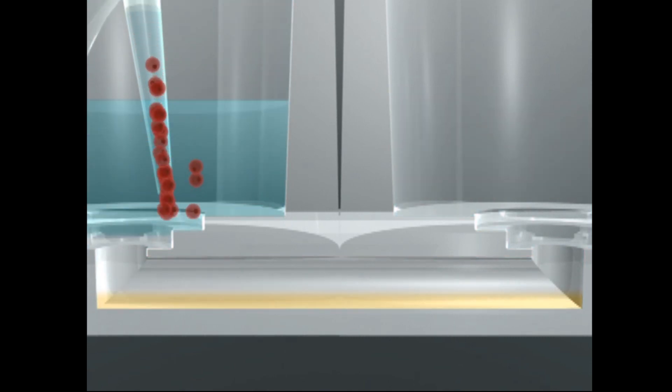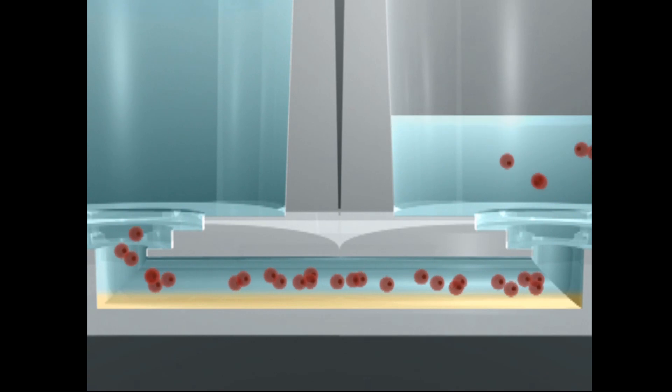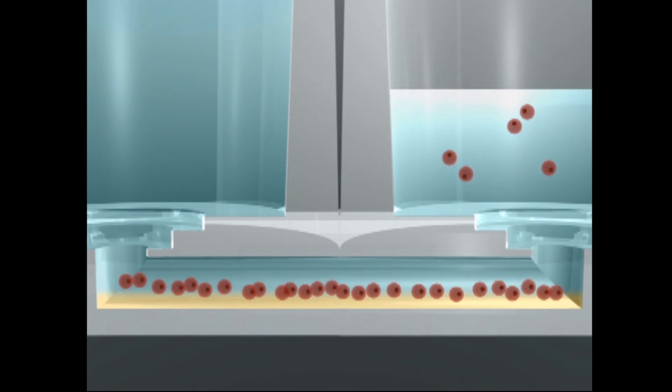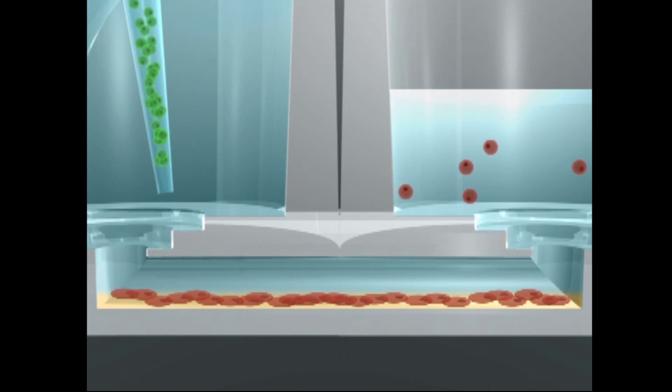Cellular monolayers can be formed on the bottom surface to perform cellular interaction studies. Cells in suspension are introduced into the channel and allowed to settle. The cells are allowed to attach and form a tight monolayer under controlled temperature and environmental conditions. At this point, additional circulating cells can be added into the chamber under controlled shear flow.